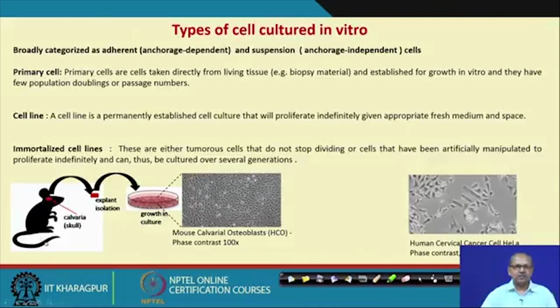So, after the ethical clearance, we can use this mouse, anesthetize it, and using a sharp scissor, we can take a little bit of tissue from the skull, then chop it into very small pieces. Then we can incubate with trypsin solution for maybe 5 to 10 minutes to remove the ECM matrix, then pipette several times to make a fine suspension, then pass it through a fine mesh to get the cell suspension. Then you can centrifuge a little bit to remove the excess trypsin, wash again to remove the excess trypsin, or you can neutralize the trypsin using a little bit of BSA, then suspend it again.